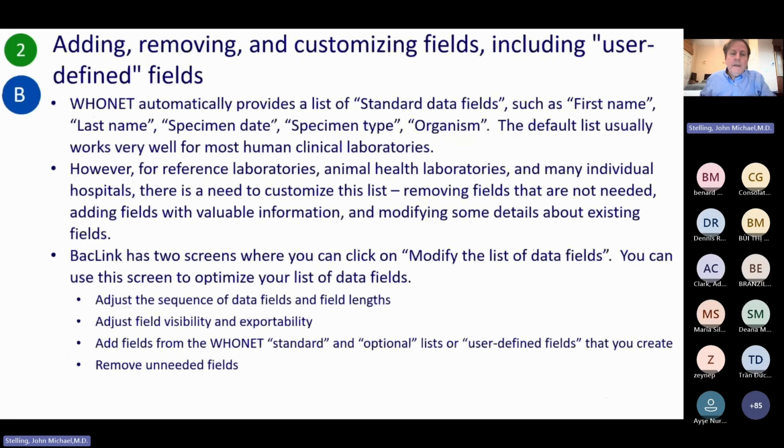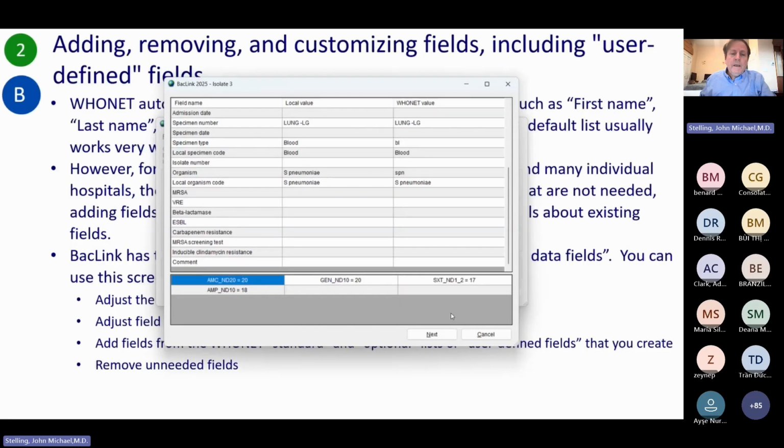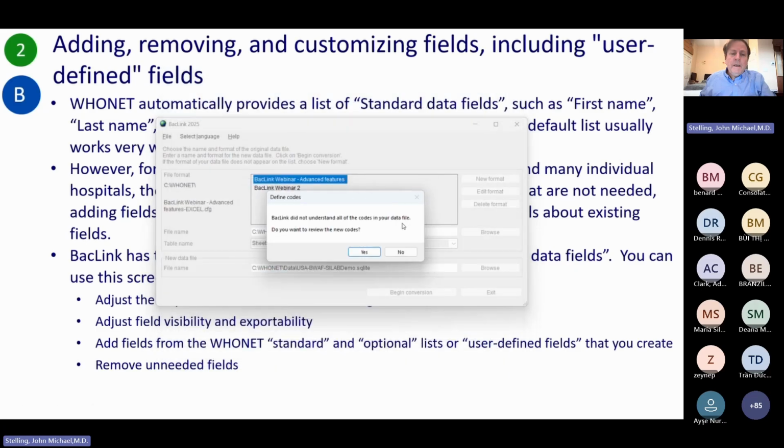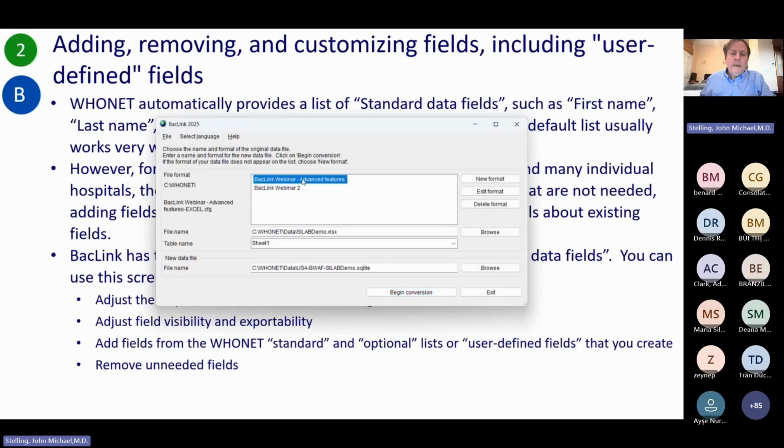Okay, next screen. Adding, removing, and customizing fields. That's what we will look at now. Go back to BacLink. Let me close out and cancel. Save changes, no. Discard. Do you want to review the new codes? No. So I'm going to BacLink Webinar Advanced Features, Edit Format.